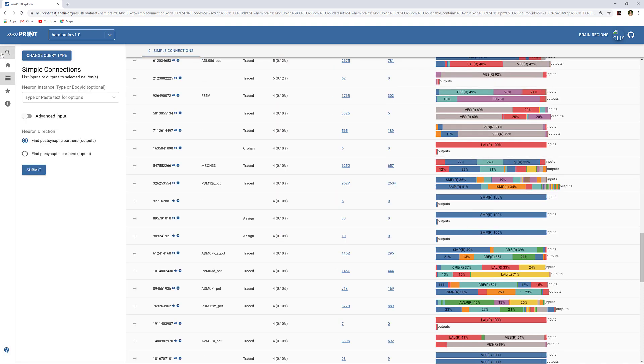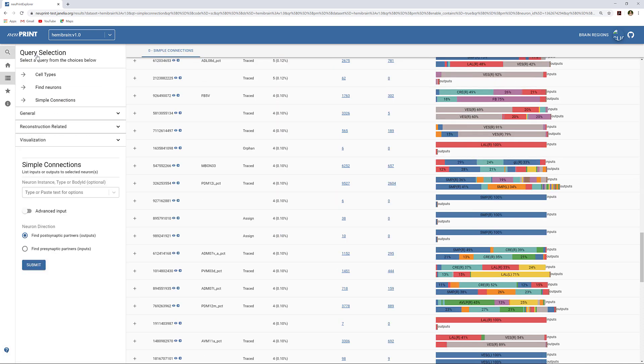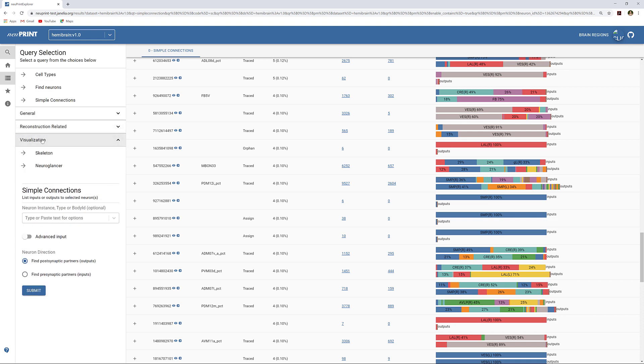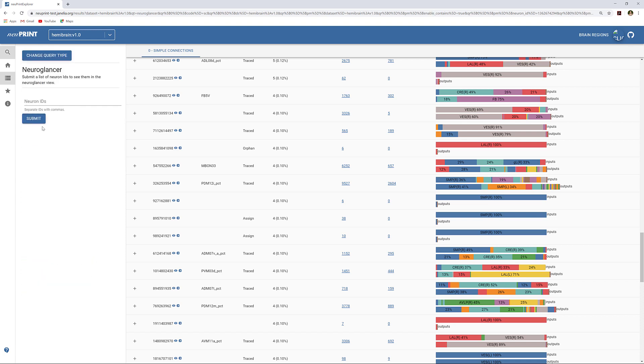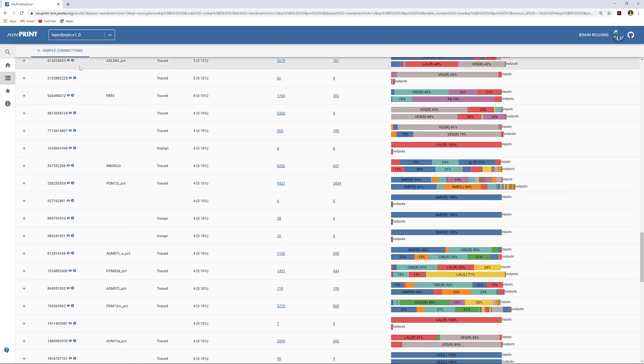We can do this by using the NeuroGlancer feature of NeuPrint. There is a NeuroGlancer built-in query, but from the Simple Connections query, we can pull it up by clicking the eye icon next to the body ID.